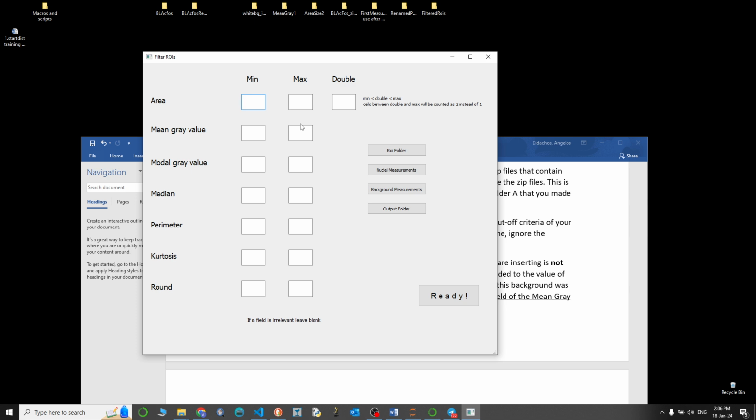We will also inspect visually and rectify manually, but we're running this code because we want to have our predictions as optimal, as good as possible anyway.